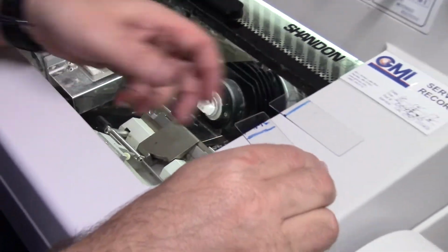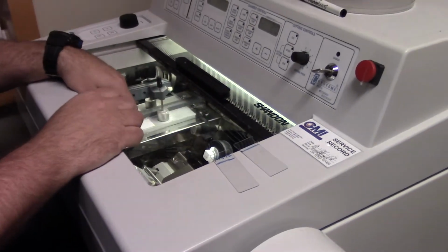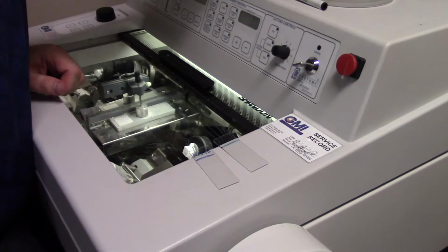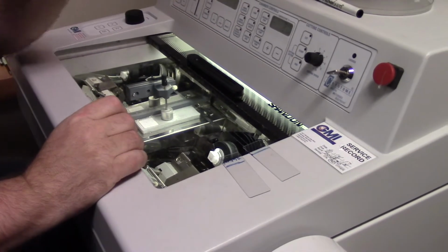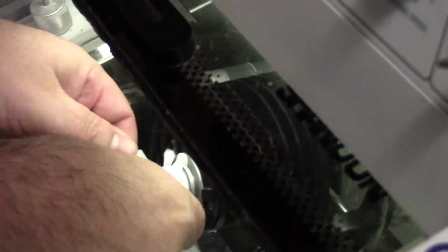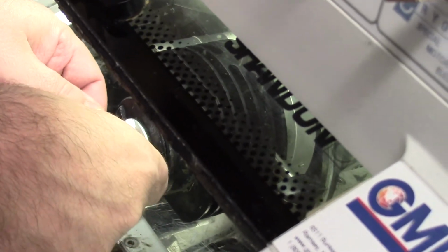I've got both my slides ready, but we're not ready yet to start cutting this because we got so much more OCT than we need. So let's take our friendly neighborhood razor blade, the one that I'm not afraid to hold with my hand, and let's do what is called trimming the block. So what I'm going to do here is cut away small bits at a time of the extra OCT.